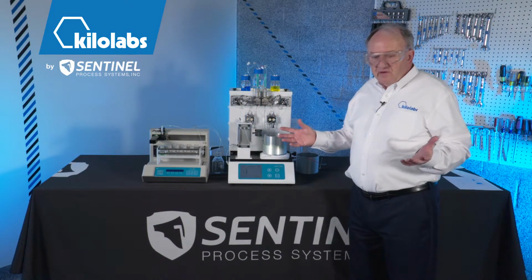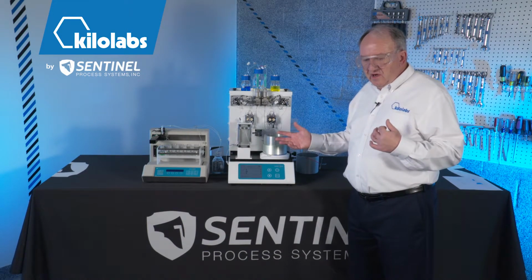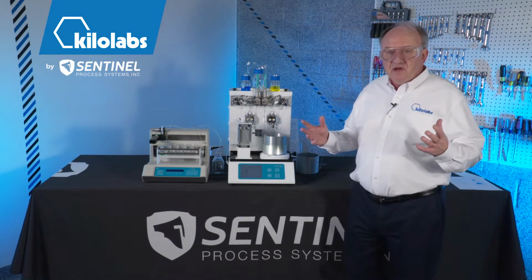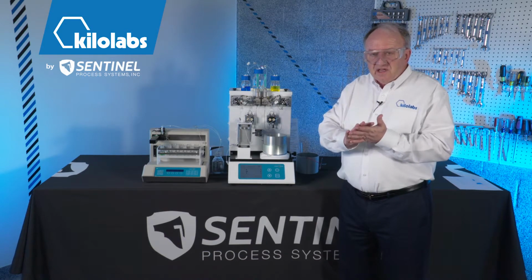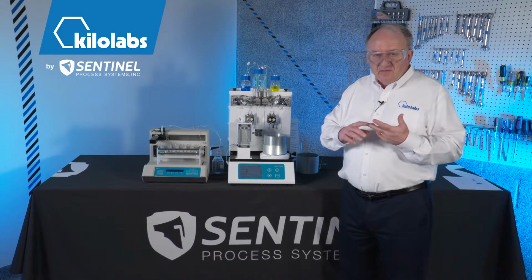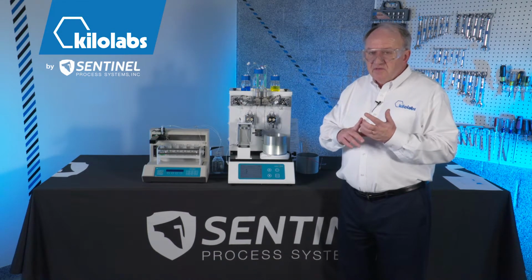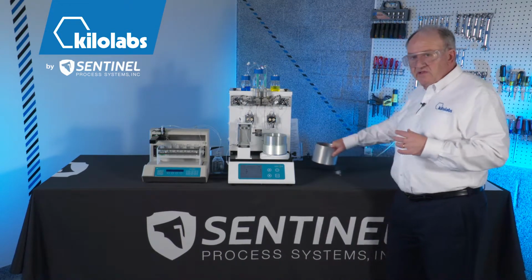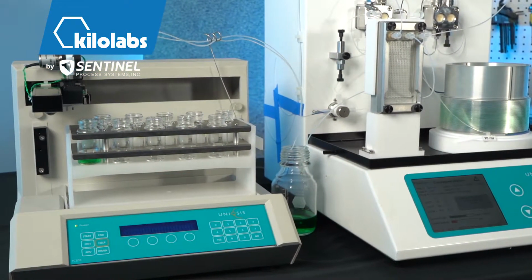So anyway, I've taken you through two sets of reaction conditions with the automatic system. I've shown how it could go to do 10 reactions at the same time. Again, in this particular instance, the residence time, the volume of reagents, and the temperature can be pre-programmed in for all 10. There are many more degrees of freedom with this system, meaning that there could be additional coils like this put in sequence with other systems that are connected, that are slave to this robot.